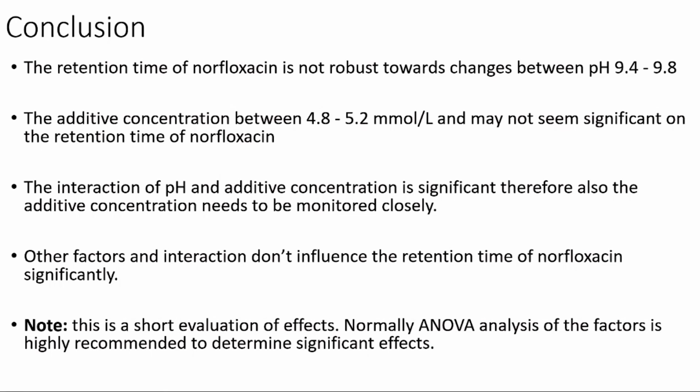Lastly, we have seen that the other factors and interactions, like column temperature and the interaction of column temperature with pH, for example, do not influence the retention time of norfloxacin in a significant way. I would also like to note that normally in the design of experiment approach, you would apply statistical tools such as ANOVA to determine p-values to really be sure that you have significant effects. We have used only subjective methods here. But given that this course is an introduction, we decided not to include these techniques.